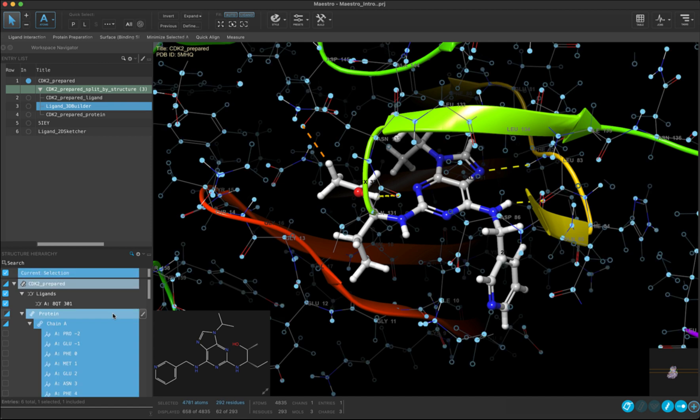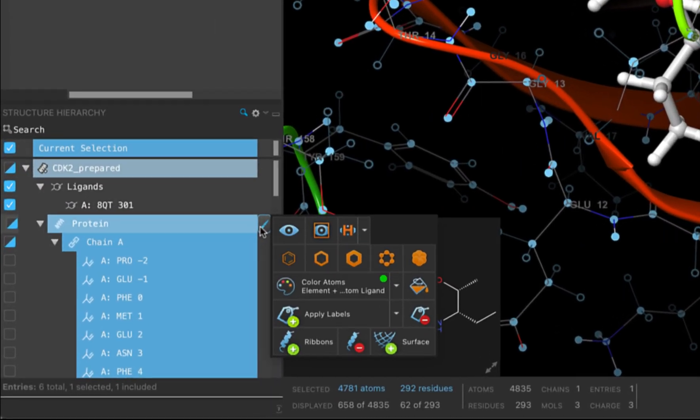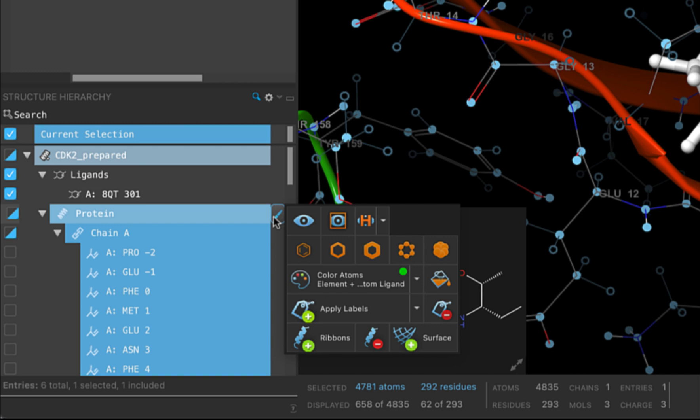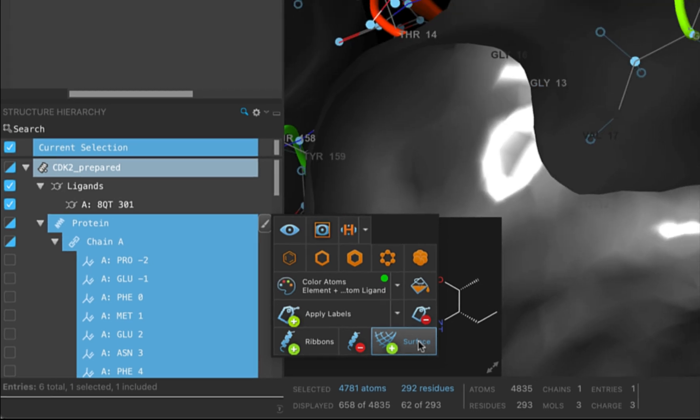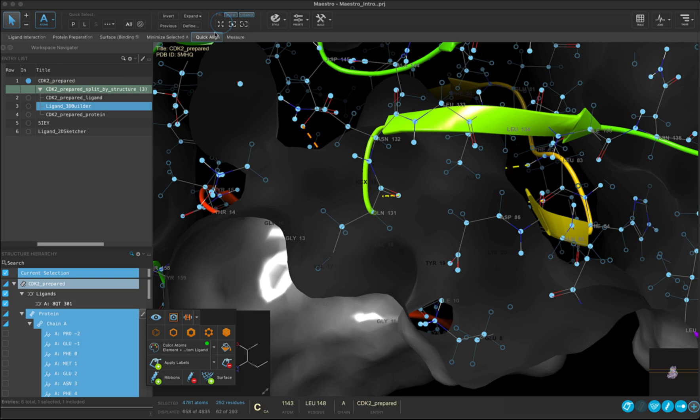The next thing we are going to do is add a surface. There are several ways to add surfaces, and one is from the structure hierarchy. We can do this just by clicking surface here. Now this might take a little bit of time when you first do it. Once this happens, you will see that the entire protein is now viewed as a surface, with the default color being gray. Let's zoom out to see a bit more clearly.